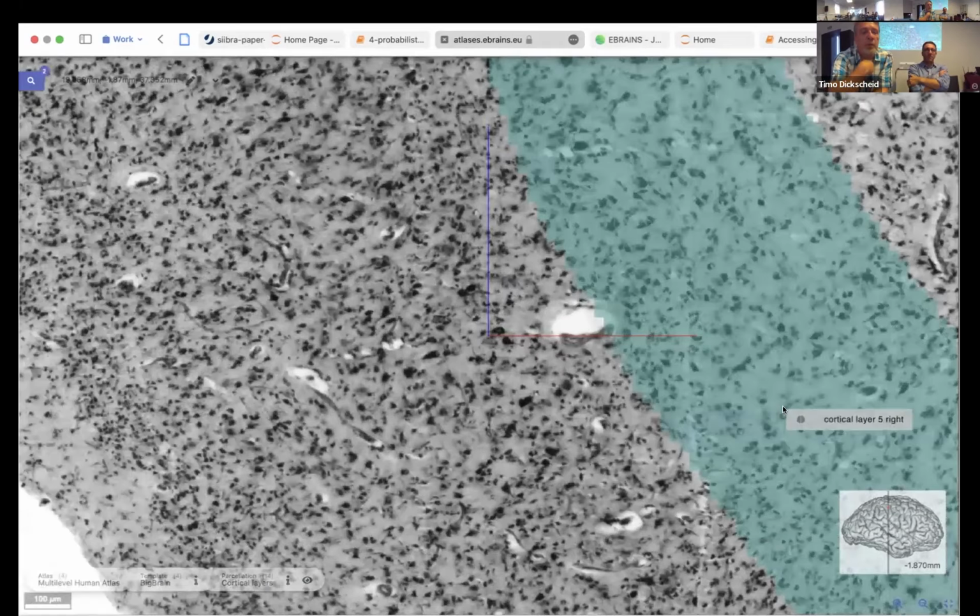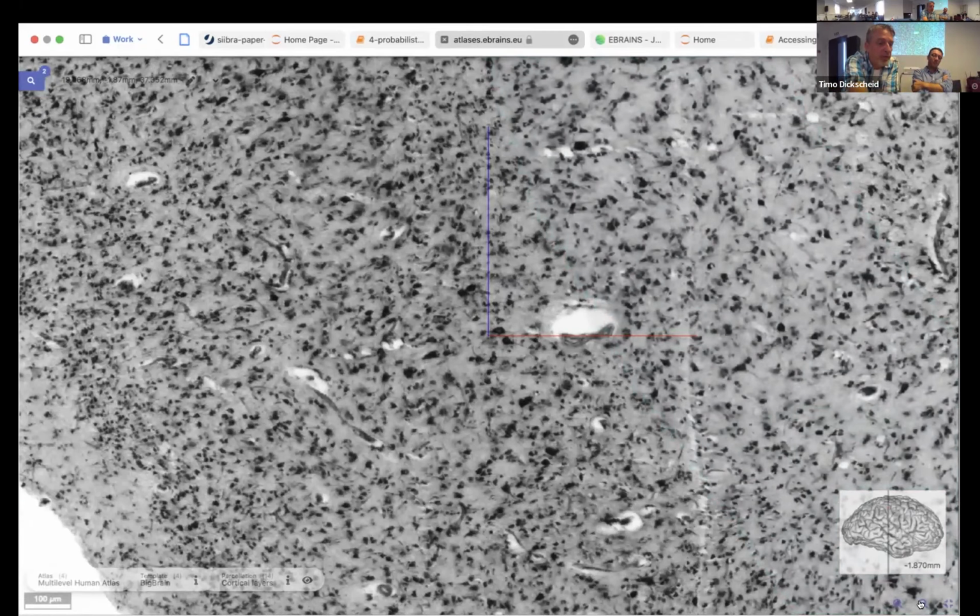And at the moment, there are 150 sections available here in the viewer. So it's roughly every 50th section which is anchored and can be used. So you can extract data sets here from the viewer, but you can also interact with those 1 micrometer data using the Python library if you really want to create your own workflows with the data sets.